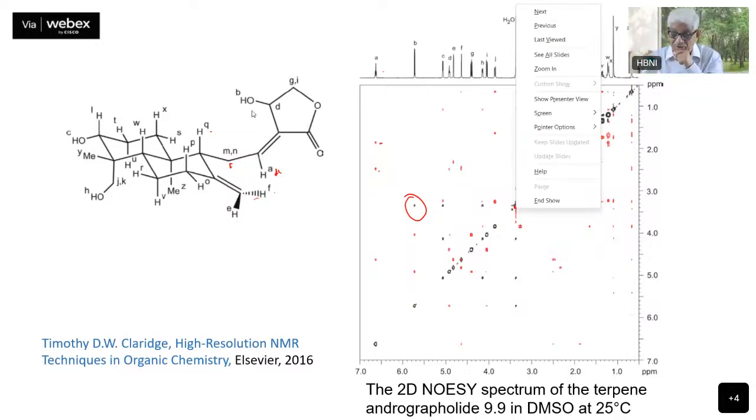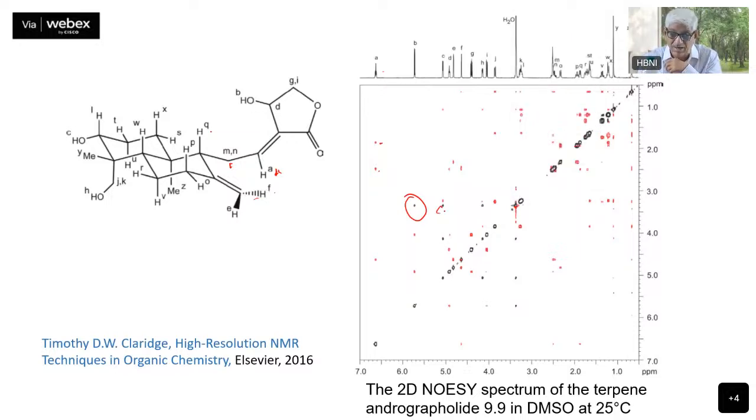Then you even see that in all of those, similarly C also. C also is this one, and this is here also. All of those hydroxyls are showing exchange peaks to the water. So therefore, this is such useful information.